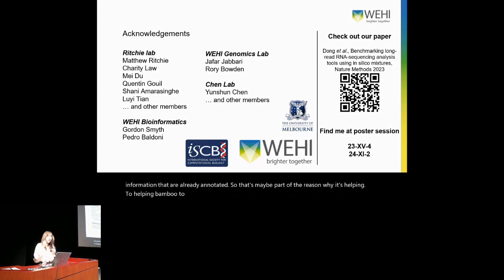And also we found that Bambu outputs all the transcripts that are provided in the annotation into their discovery. So maybe that's part of the reason why we're getting a higher recovery rate from Bambu.